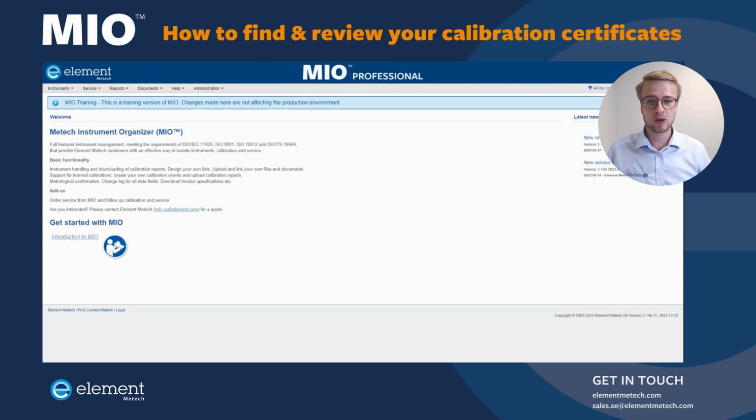Now I'm going to show you how you can easily find all your calibration certificates and review them all in one place. So let's say that you want to review those certificates that did not pass the calibration according to the specification. A great way to do this in Metech Instrument Organizer is to go into the Reports module.